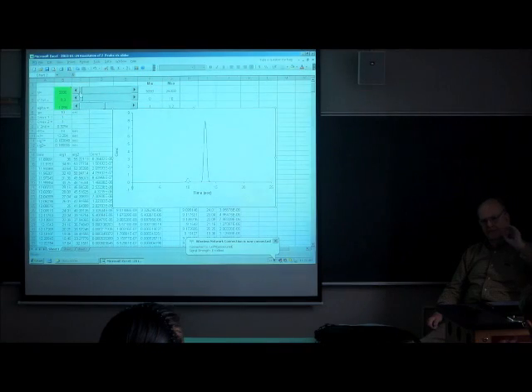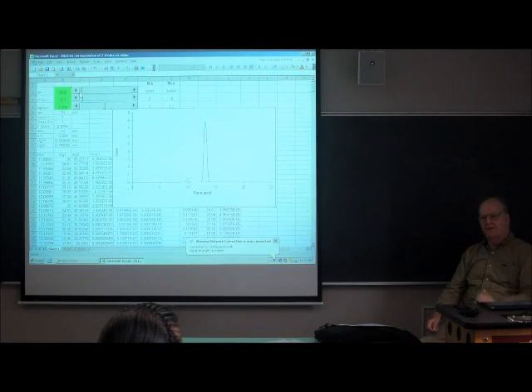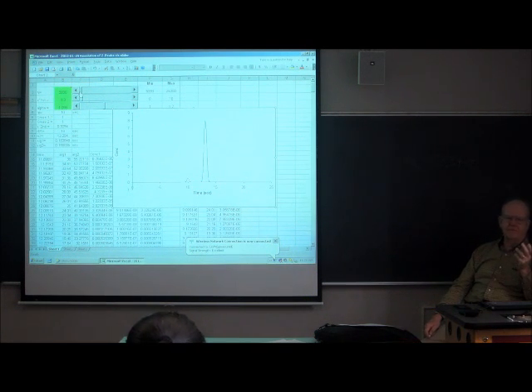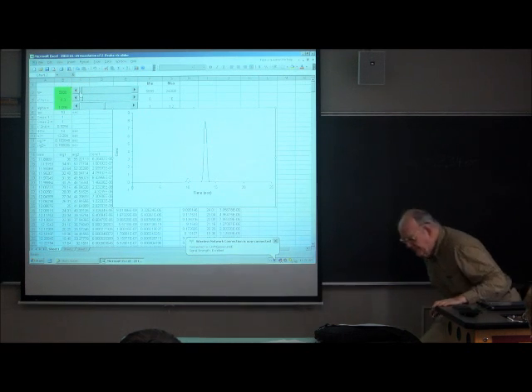Quite get to the very last thing I wanted to do, and that was to show you some simple results of the resolution equation and show you the impact of those three factors, the N, the plate count, the retention factor, and the selectivity.